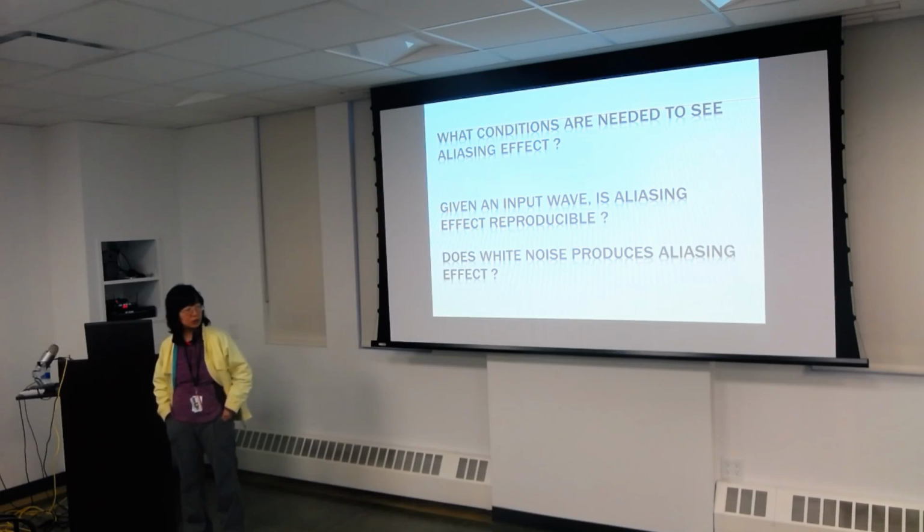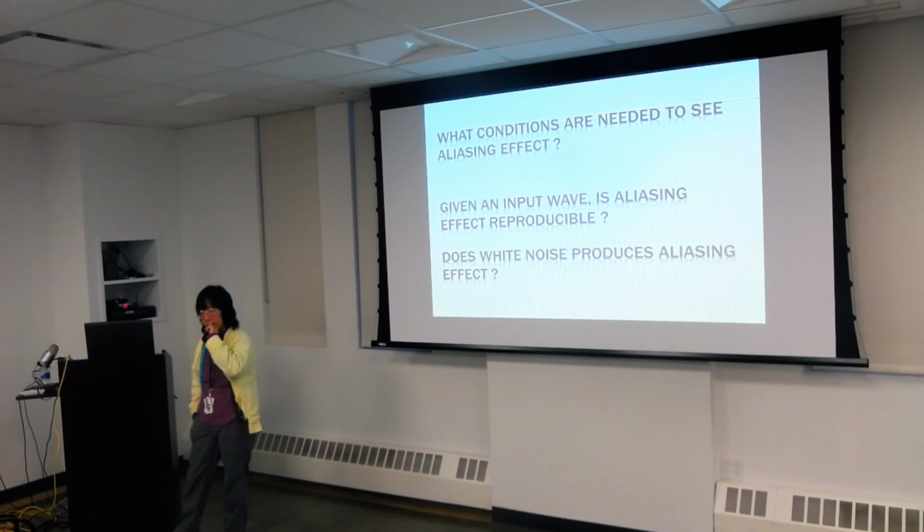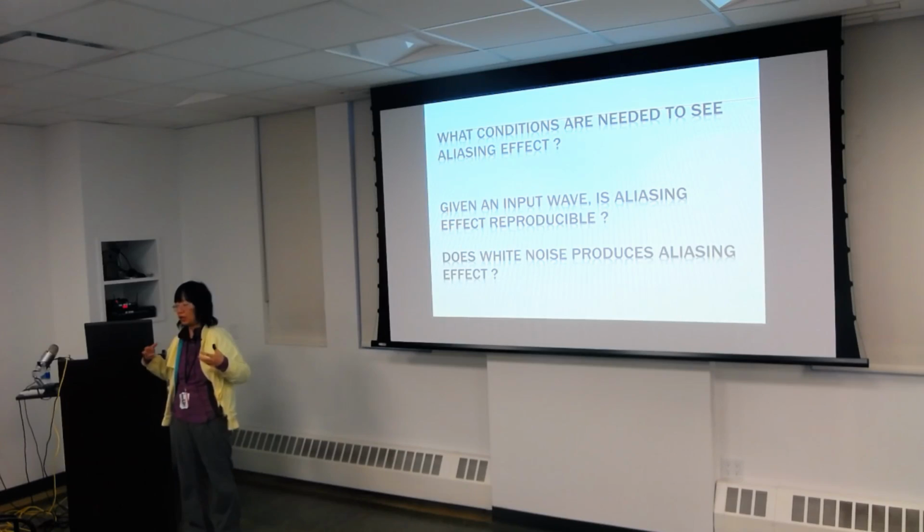Now the other thing, when Yonzi and I discussed this in the morning, he had an idea saying that it probably doesn't do anything, mainly because when you think about the so-called noise, it means that they are not going to constructively interfere with each other. So when the noise gets aliased back into your region, it's not going to add up. That's basically the characteristic of noise, right? Signal adds up, but noise doesn't, because they would never be at the same place at the same time. So you don't actually see the effect as much. So that might be the answer.